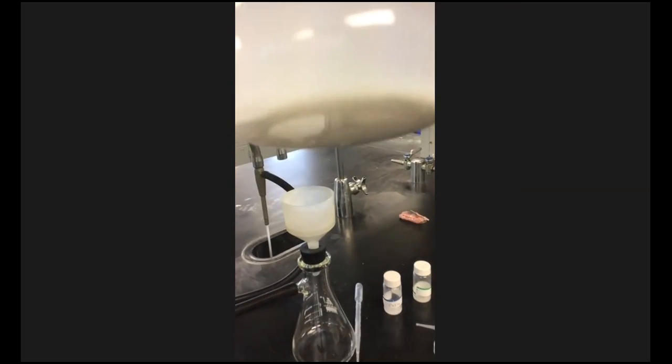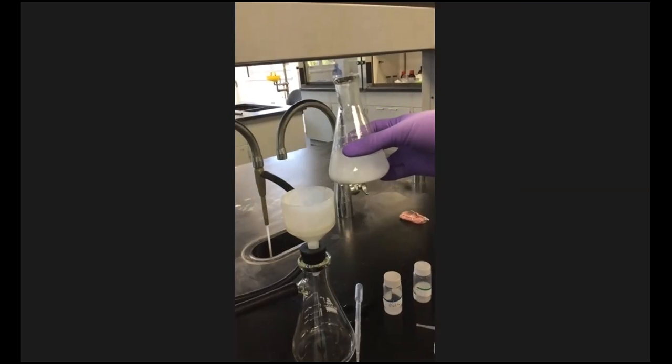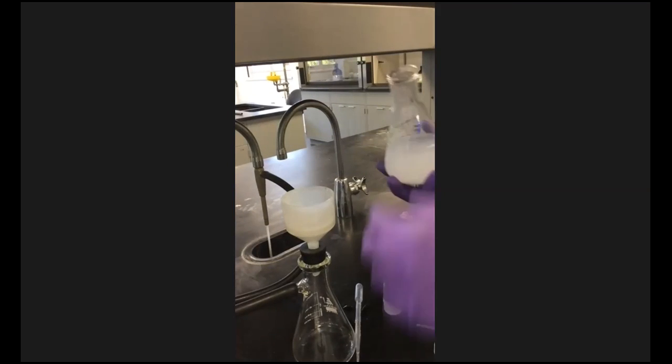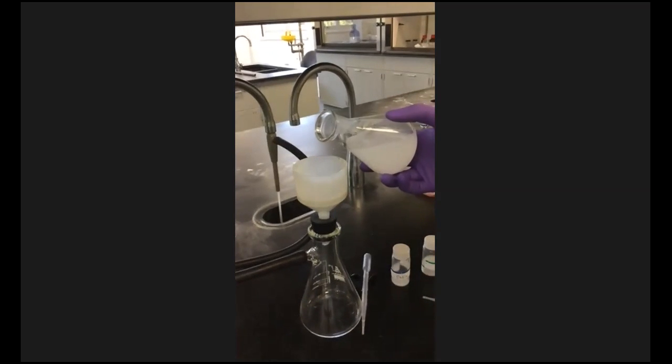Look at that. That's a whole lot. So we're going to take this and filter it off. And you can see with the vacuum, the liquid start to go down into that filter flask.